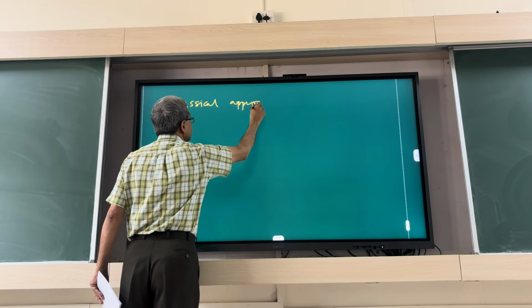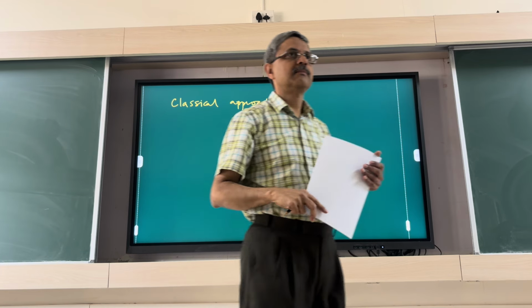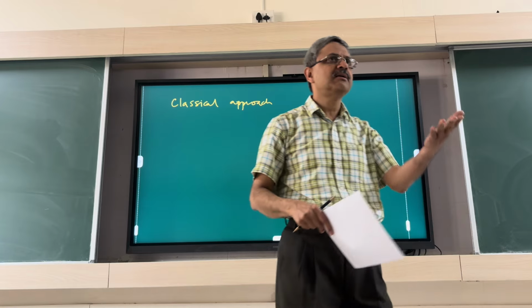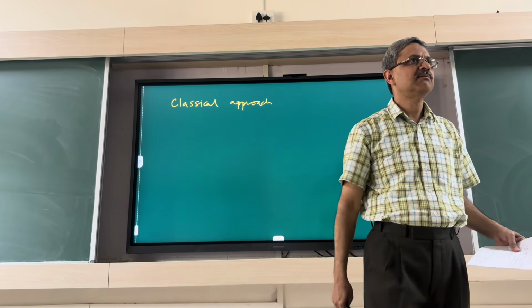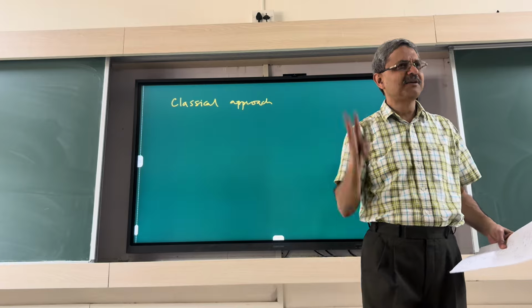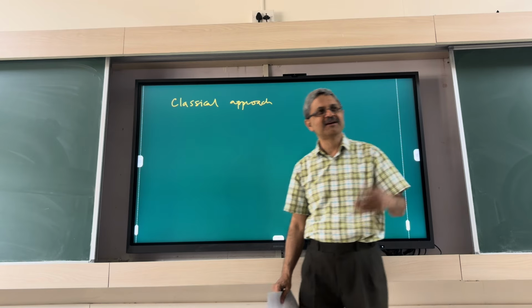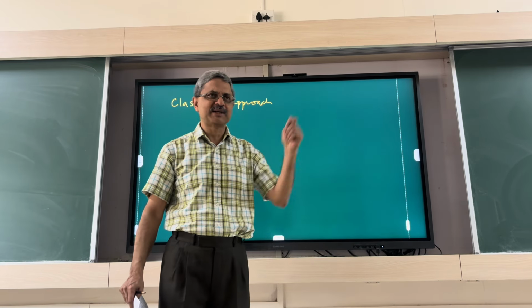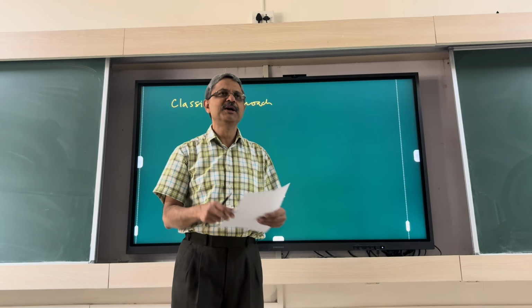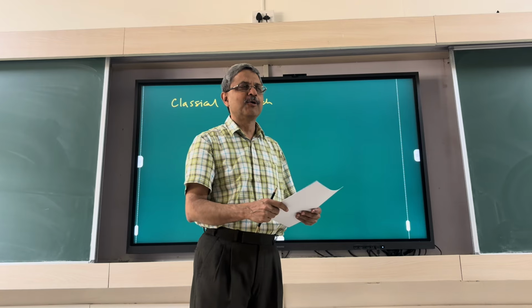The RF unit needs very fine noise control. You have a function generator that gives a sine wave, a simple DSO-kind of setup. I'll talk about the technical parts at a later time. You generate a precise frequency with electronic instrumentation. You need a frequency synthesizer giving a particular frequency, and then what do you vary?